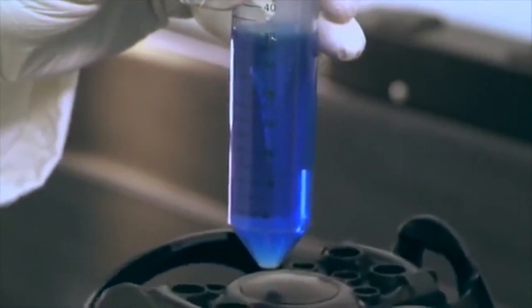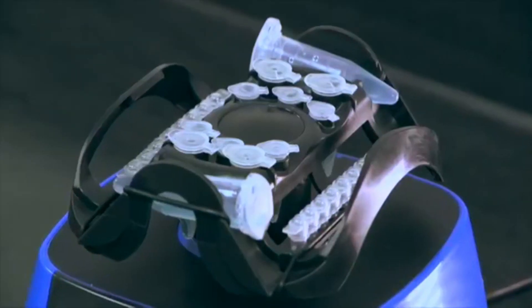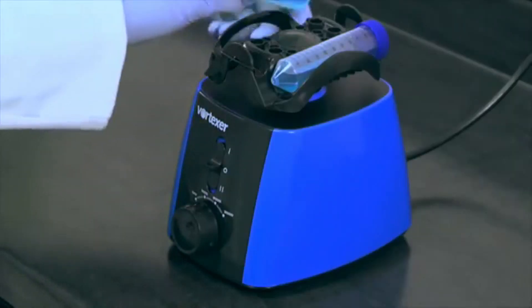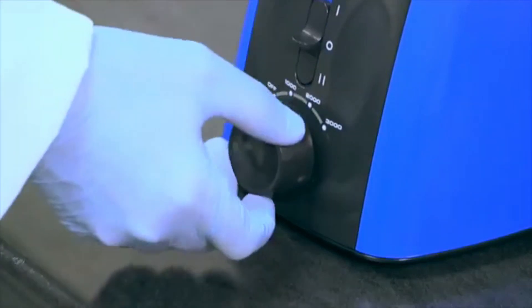A truly great product is ultimately defined by its functional design. Introducing the Vortexer, an innovative design using one mixing head for a variety of tube sizes. This results in the most functional unit for a range of applications requiring gentle mixing or high-speed vortexing.